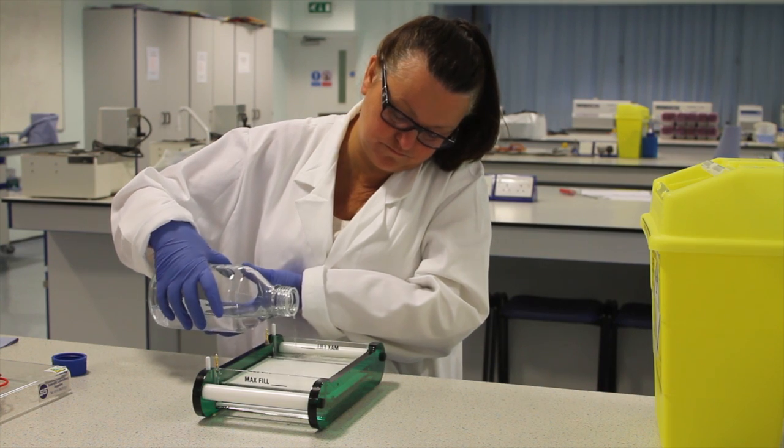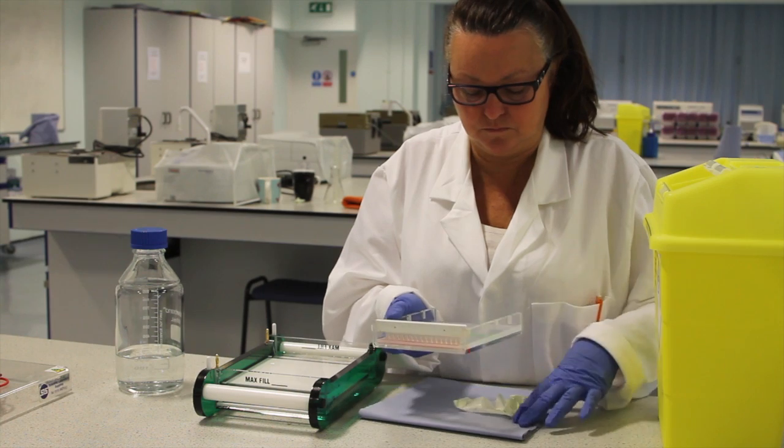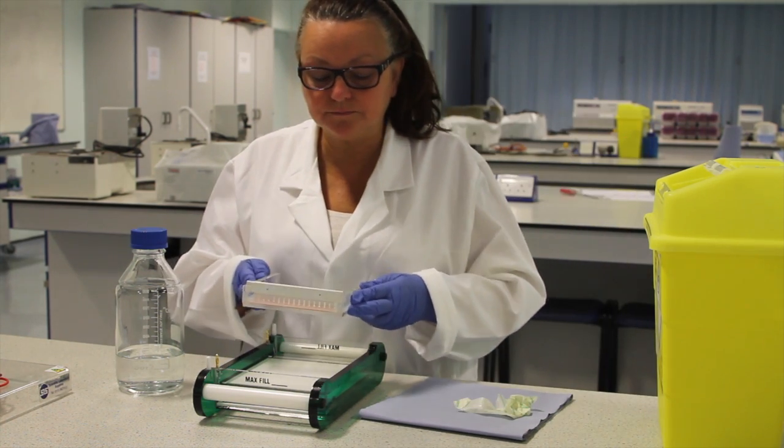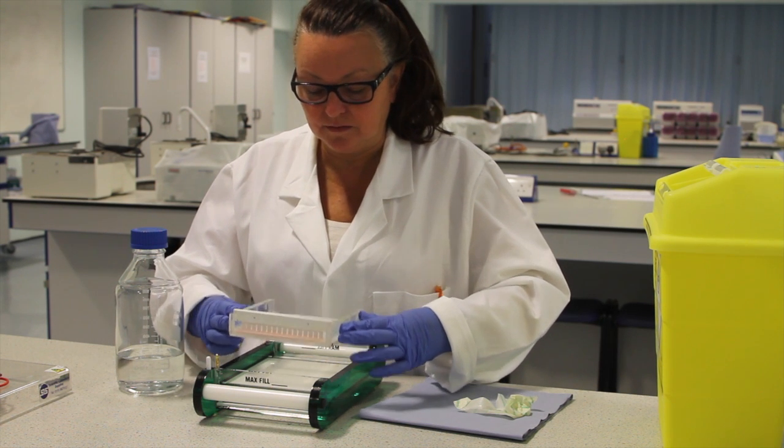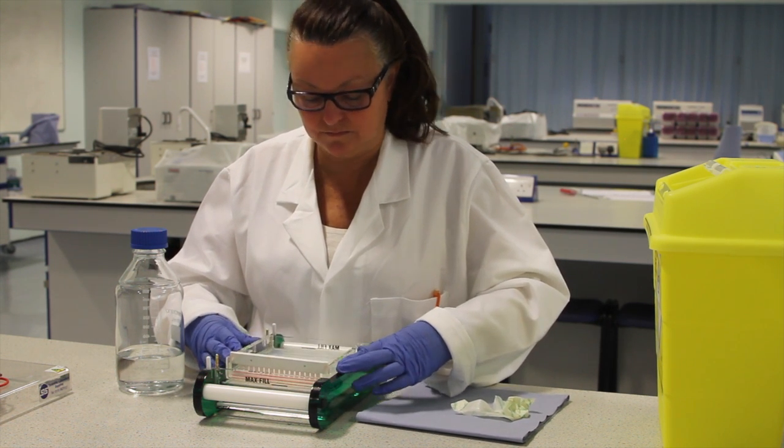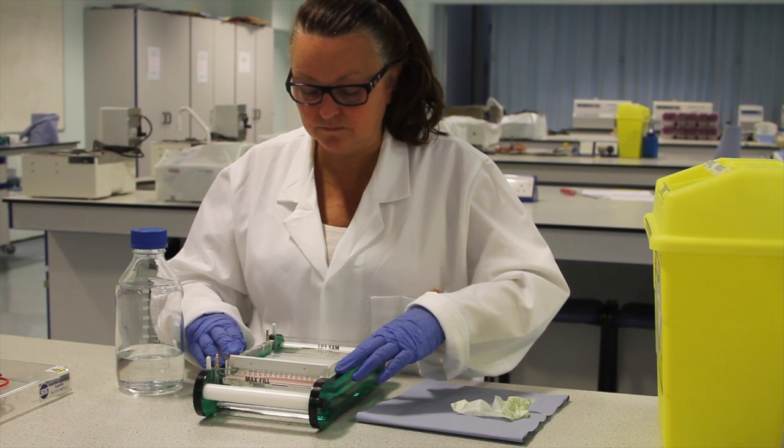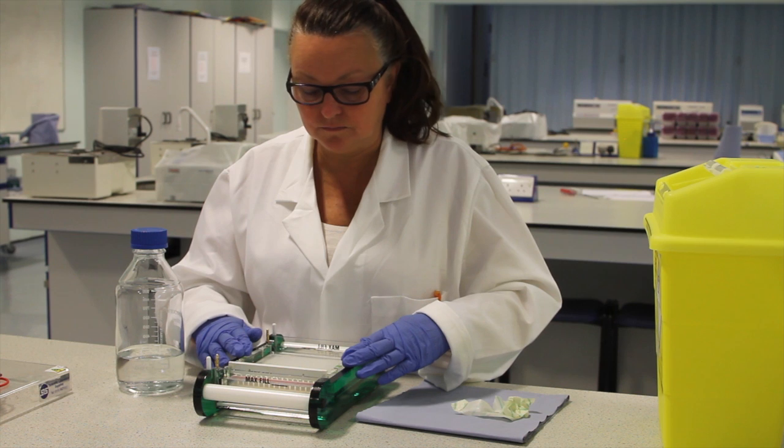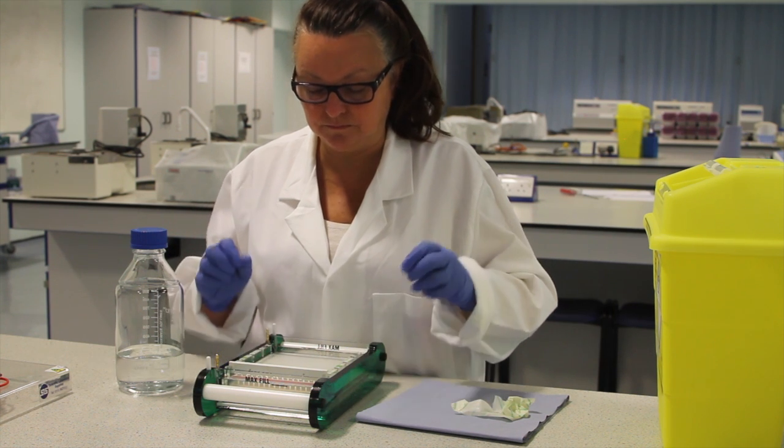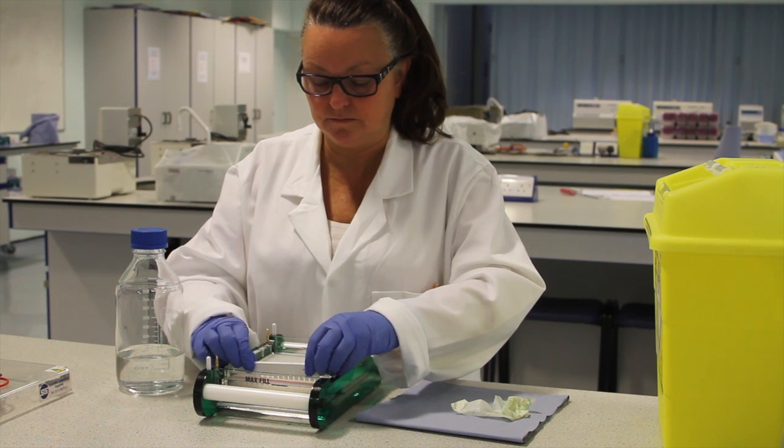Remove the tape and dispose of it in the ethidium bromide waste and then carefully place the gel in the tank. Top up with buffer if necessary. There should be a thin layer of liquid covering the surface of the gel. Remove the comb only when the gel is inside the tank.